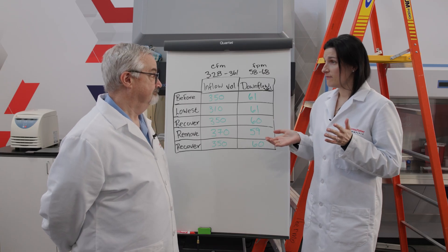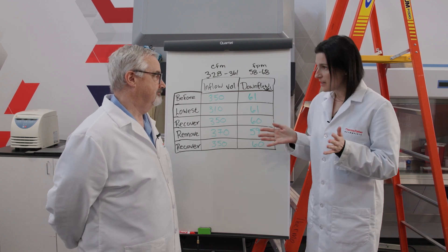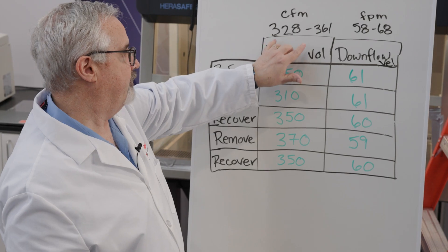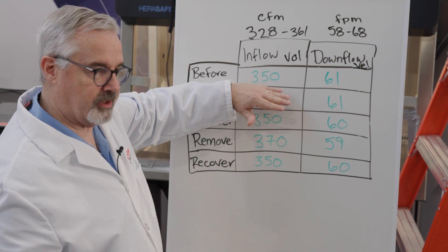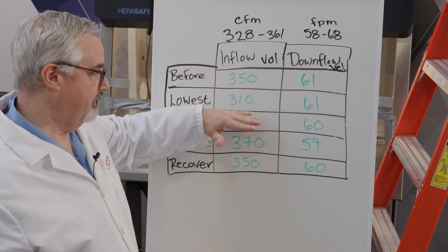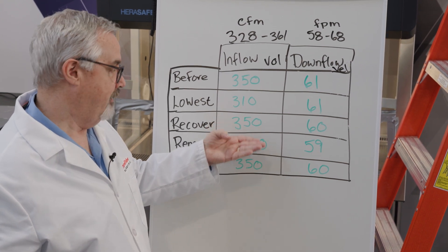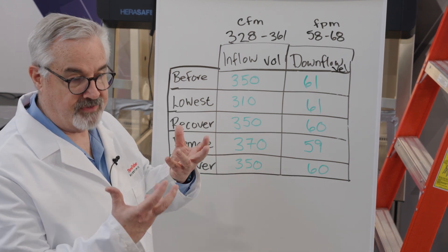So Dave, I found that really interesting. Can you explain what just happened? I am very pleased with this data set — you can see the airflow compensation working wonderfully on the inflow. For this cabinet to work correctly, it should be between 328 and 361 CFM. Before we started it was okay at 350. When we added the restriction it dropped to 310, but the cabinet reacted, sped up the fan, and brought it back up to 350. When we removed the restriction it overshot, but the compensation kicked in and dialed back down to 350.